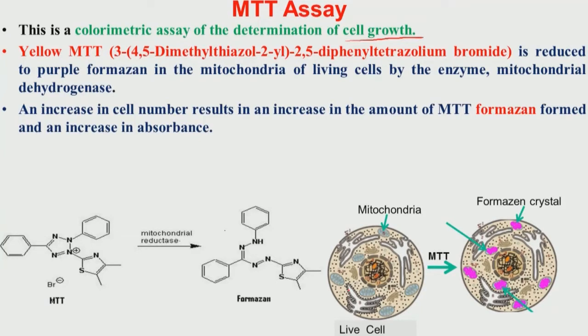That means you need to determine the change in the optical density before you add that specific biochemical reagent, and after it is added to the culture medium.